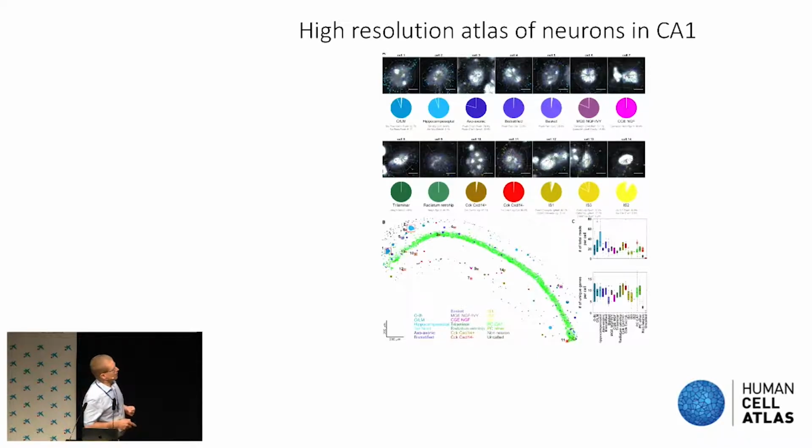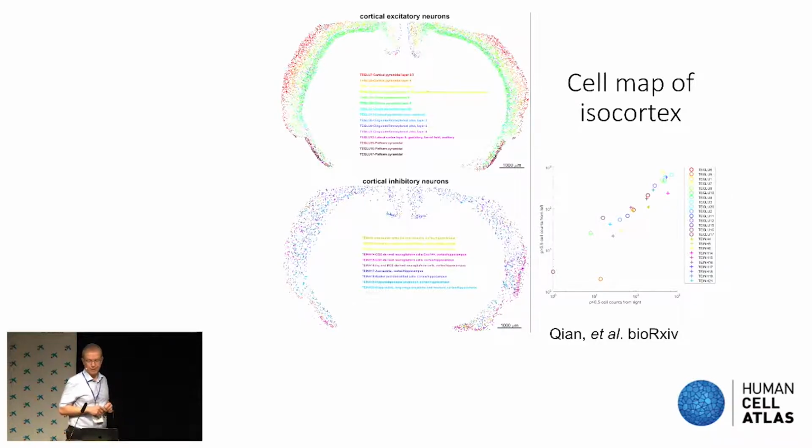And this can be done with low numbers of transcript detections per cell, about 20 to 30 per cell, but because we're relying on the deeper information from the single-cell RNA sequencing and the matching of the marker genes to the cell clusters, we can make these assignments with high accuracy. And because of the way we select the markers, we will only detect 4 or 5 or so different genes expressed in every given cell.